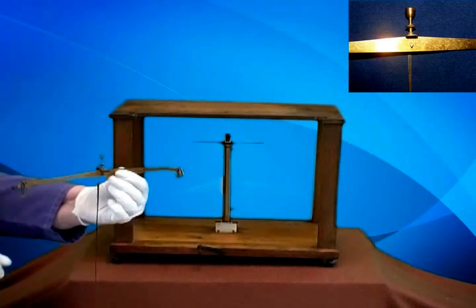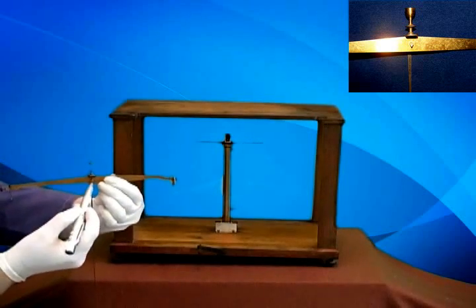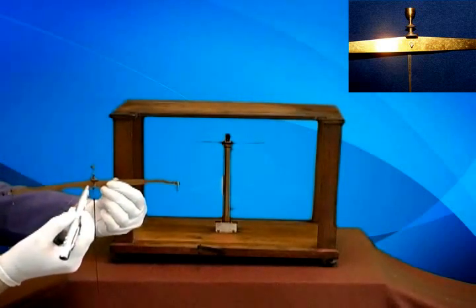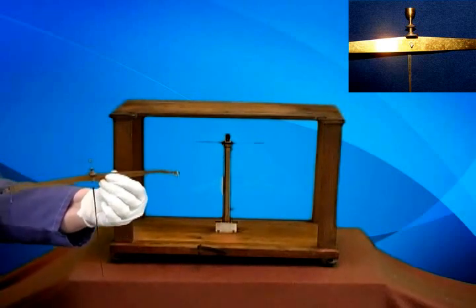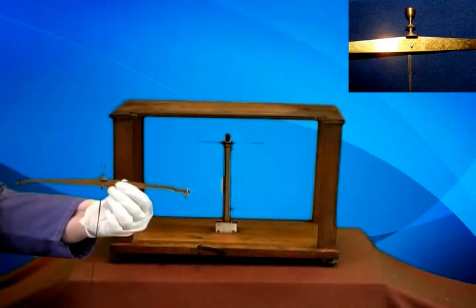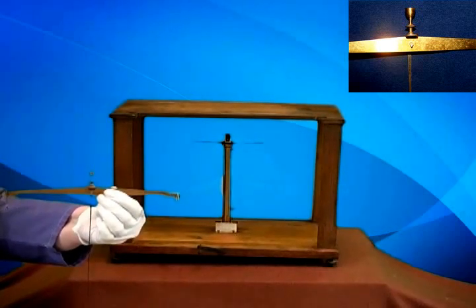Now, I want you to notice on this beam that there is a triangular area right here. And this triangular area is the knife edge. The knife edge probably in Dalton's time would have been made of steel, but the more modern ones were made of sapphire or agates.